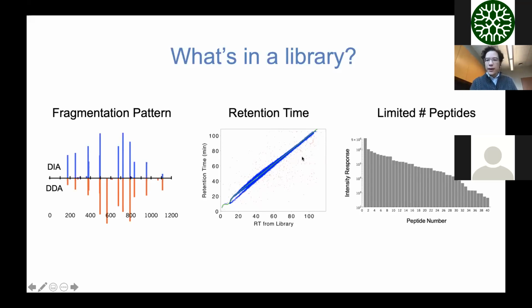And then the other major advantage that people don't normally think about is that you're looking at a fairly limited number of peptides. Typically in the library, you only have 4 or 5 or 6 potential peptides that represent that particular protein. Oftentimes, those peptides have very different intensity responses across that time frame. For example, when we were looking at those 2 peptides from superoxide dismutase, one was very easy to see and had very intense signal, but the other one didn't. That's because it doesn't ionize quite as well, so we don't get quite as good signal from it, despite the fact that they should be equimolar.